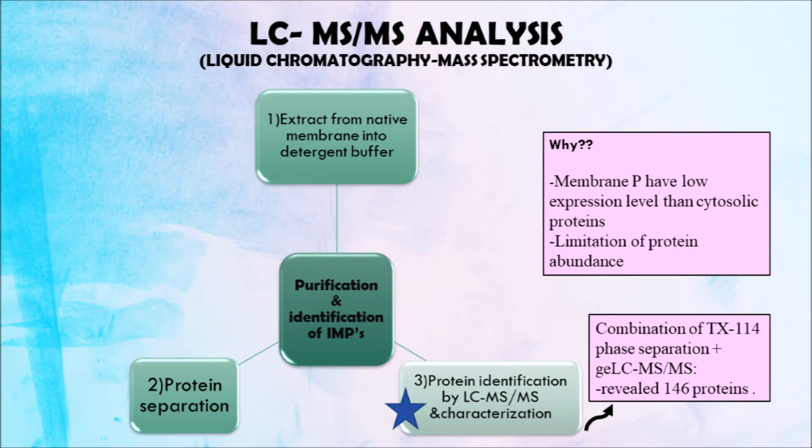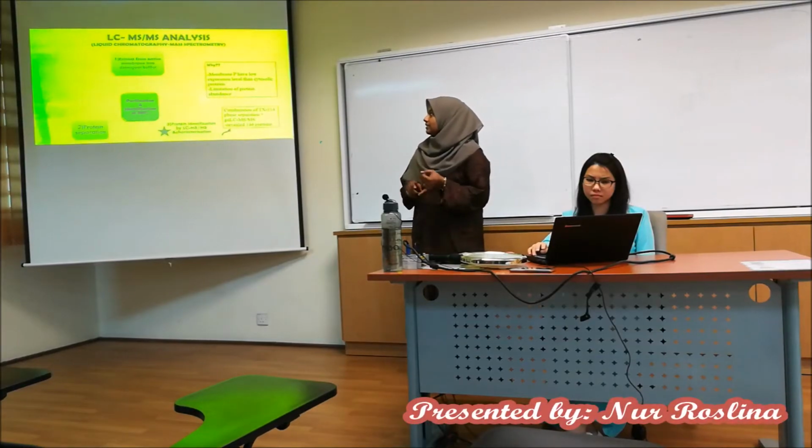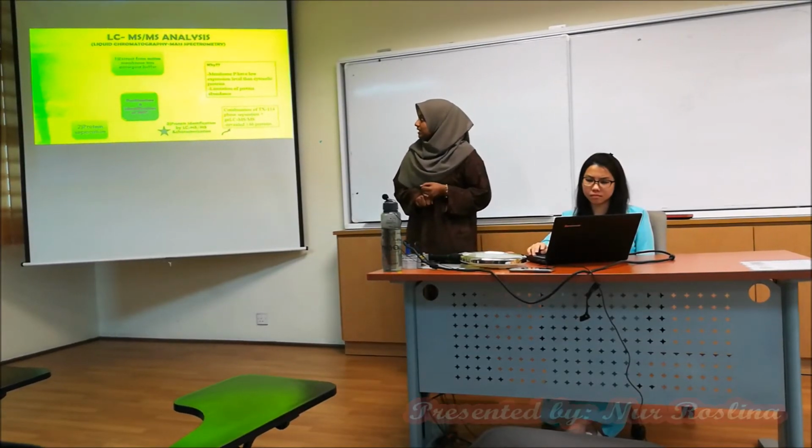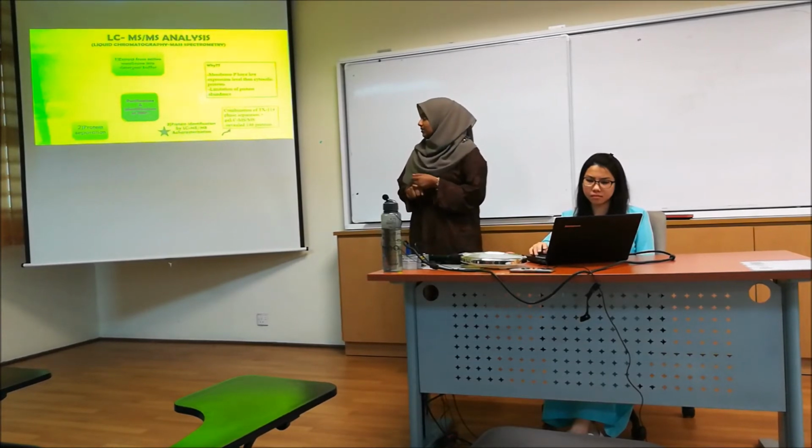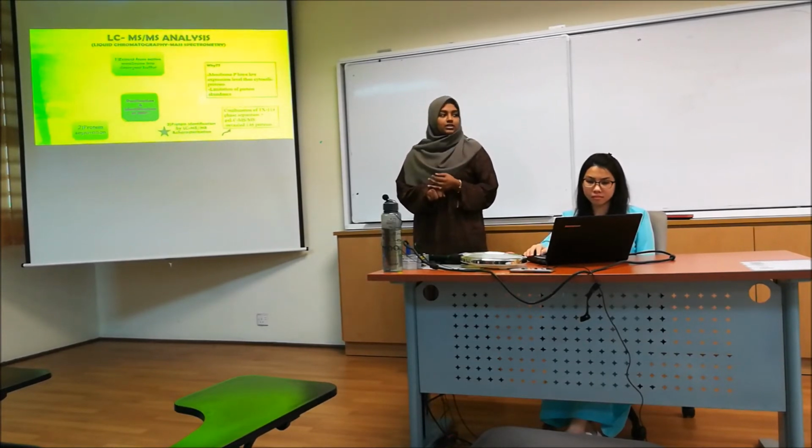LC-MS means liquid chromatography mass spectrometry analysis. This is used for the purification and identification of integral membrane proteins. Protein identification by LC-MS is one of the important steps, after extraction from the native membrane into detergent buffer and also protein separation. Protein identification by LC-MS is the third important step.